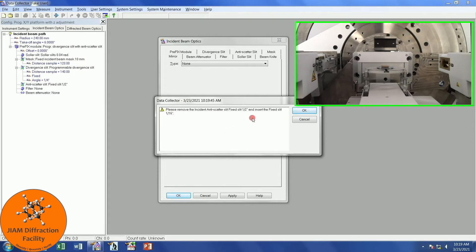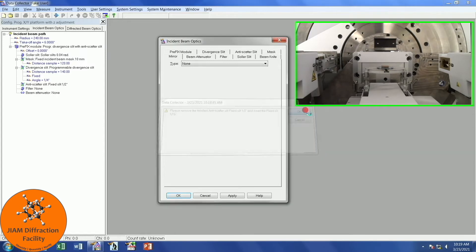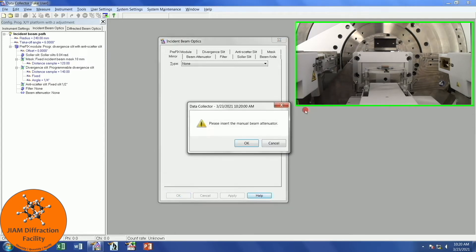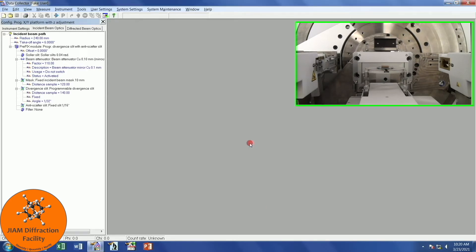This window just tells me to make the physical changes in the system that I said I did in these tabs. I changed this so I can left-click OK. Because it is so important that you insert the beam attenuator, it is reminding me to do that in a separate window. As long as you have done this, you can go ahead and click OK, but make sure you put the attenuator in. I can't stress that enough.